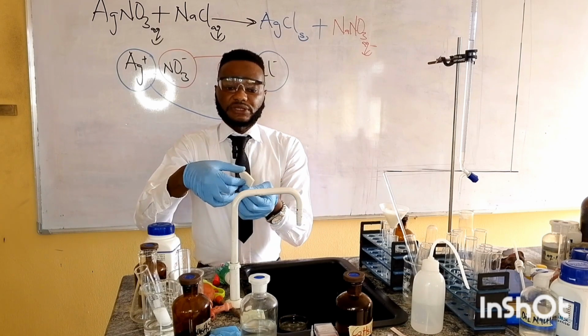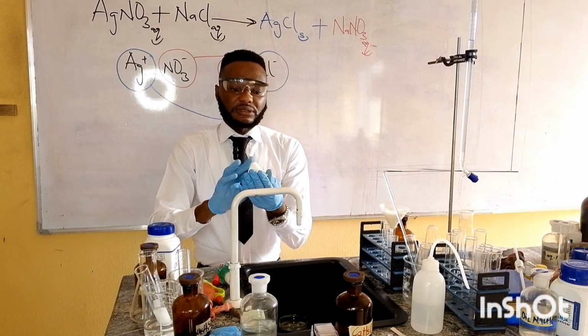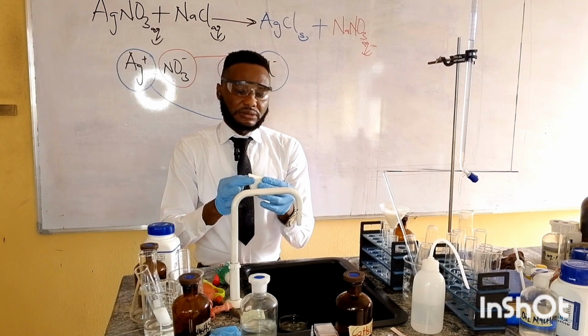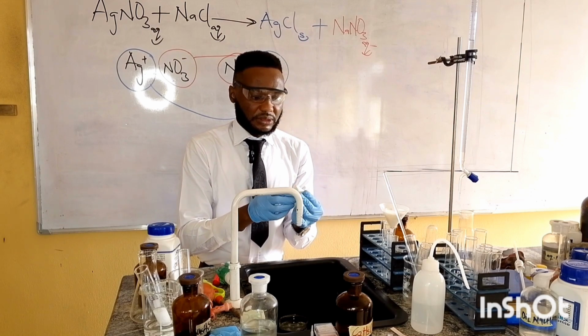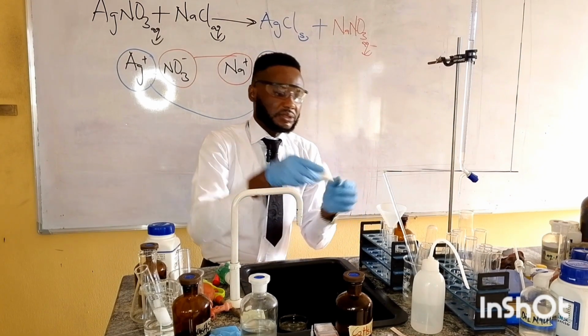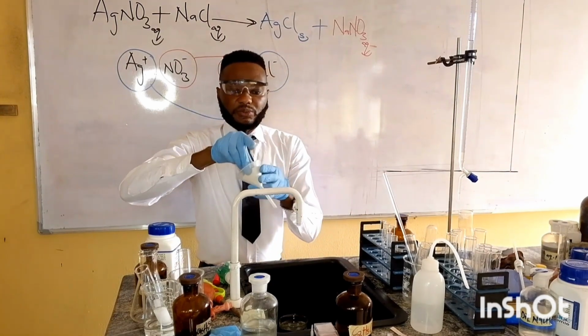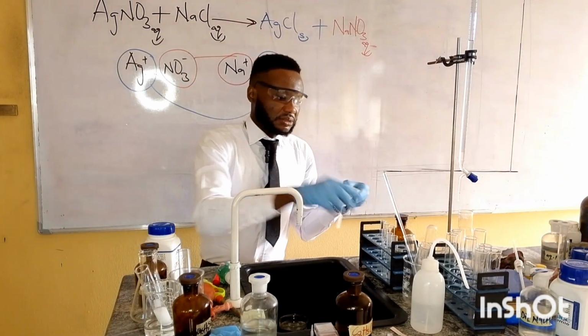So you open one side. Then we place it here.